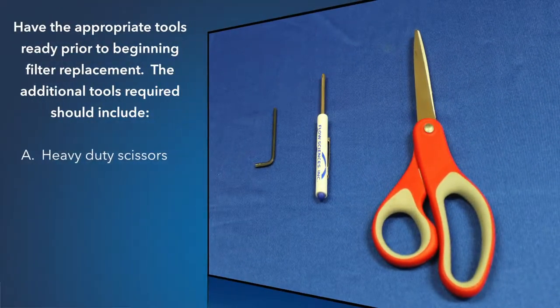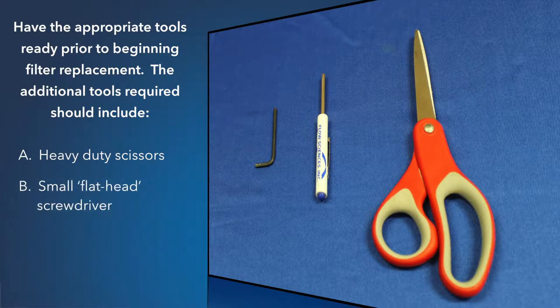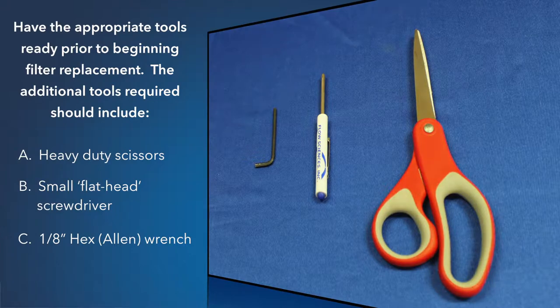Have the appropriate tools ready prior to beginning filter replacement. The additional tools required should include: heavy duty scissors, small flathead screwdriver, and 1/8 inch hex Allen wrench.